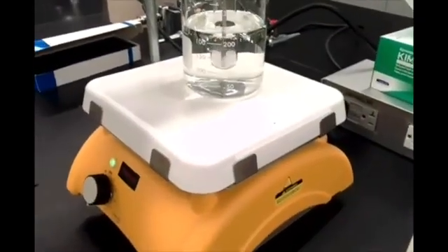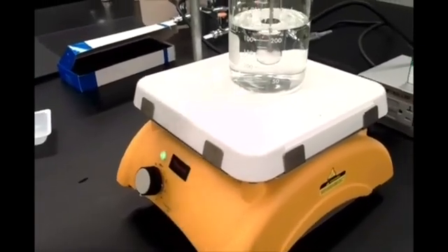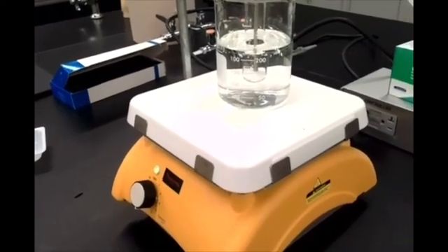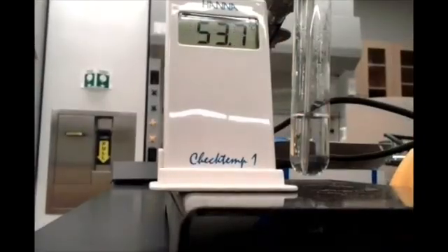So let's keep an eye on this, and I'm going to stir it with the thermometer, to try and get it to dissolve a little bit quicker. And once we've got this dissolved, we'll keep an eye on it with the webcam, so you guys can get a temperature reading on that. Okay, I've set up our hot solution here, and it's cooling down, as you can see, with the readout for our thermometer next to it.